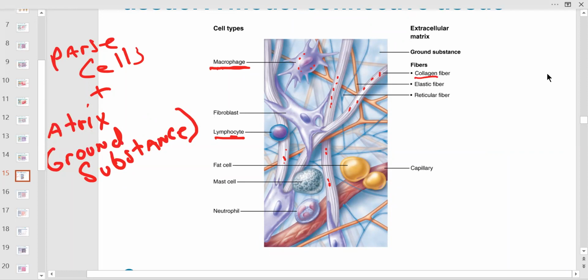And then you have fibroblasts, which are basically cells that are laying collagen down. They're making collagen, laying it down. All the machinery, all the rough endoplasmic reticulum that's in there, the ribosomes, are all building collagen for this connective tissue. So the ground substance is mostly loose pieces of collagen, and you have the thick collagen in between. Then you have these elastic fibers. This has everything, so this is kind of good. Elastic fibers give it compliance, elasticity. So you're going to see this elastic connective tissue, which is different. So this has all the parts.